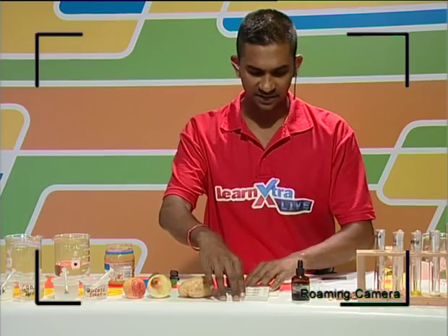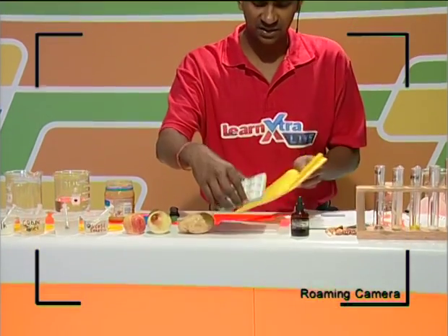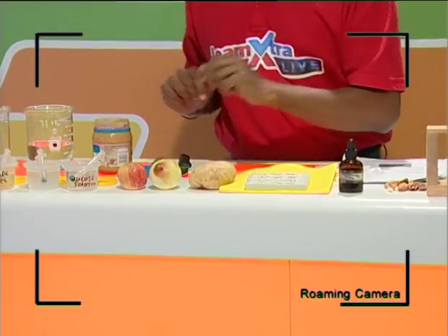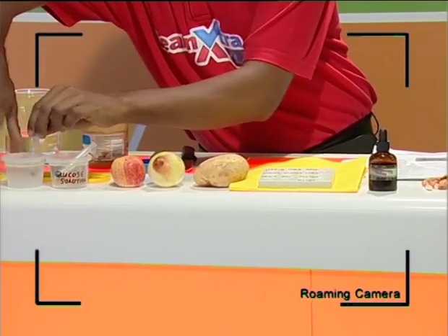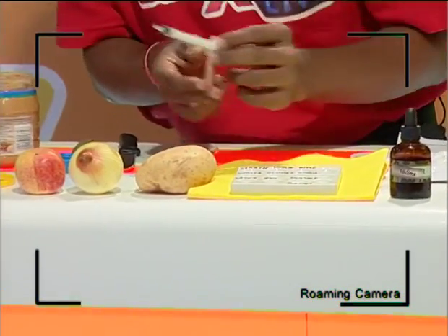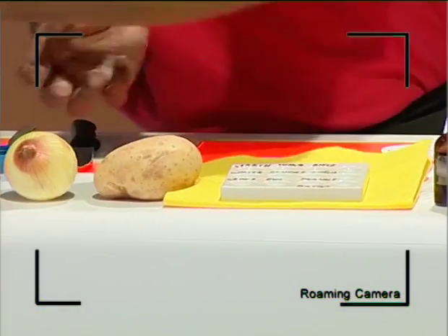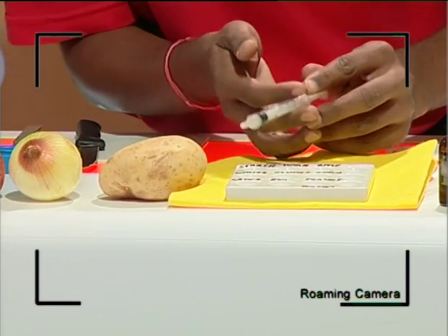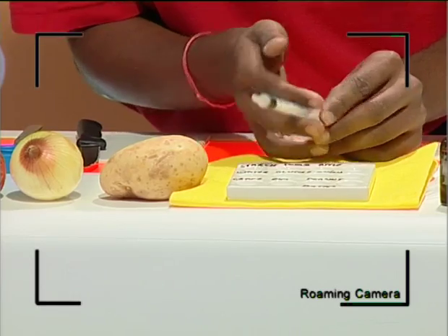So I'm going to lift this up a bit, elevate it so that you can see exactly what we're doing, but not too much, because we're going to get a bit of these drops going through. So the first well, guys, is starch. Not too much. We're going to put in a little drop, and we're going to make sure that we don't contaminate the other wells, or else the results will not give us the accurate results that we need. So that's starch, a few drops in there, guys.